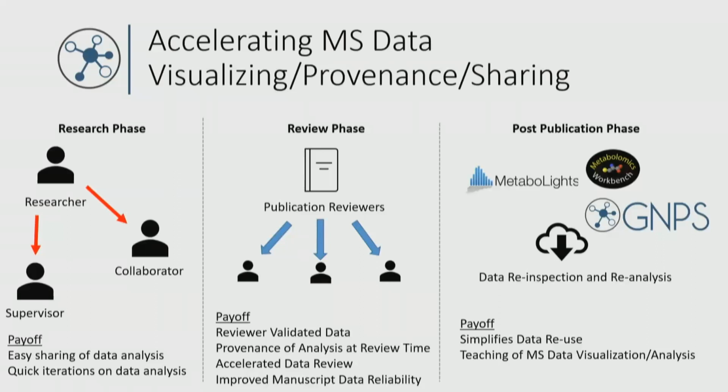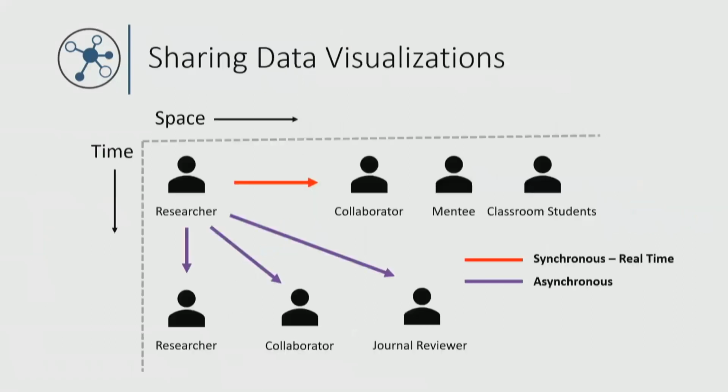So you can reanalyze data, reinspect it, and in our experience, it has really improved the teaching of MS data analysis and visualization that enables students to view across multiple different instrument platforms very, very easily without installing specific software for each one. And so I wanted to just take a step back and talk about how we're thinking about data visualization and just give you examples on how we're tackling each of these.